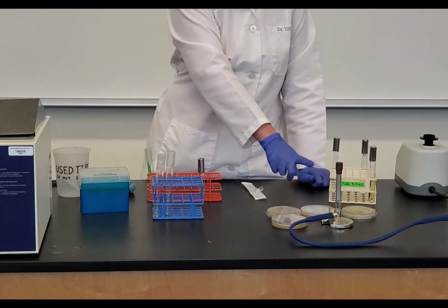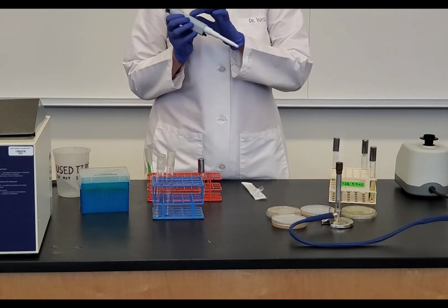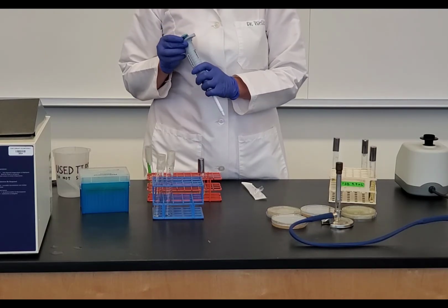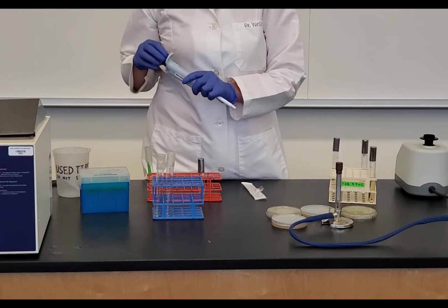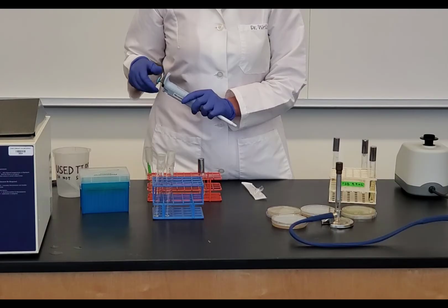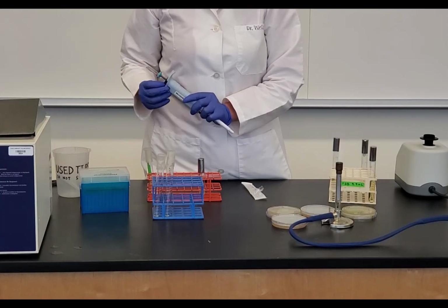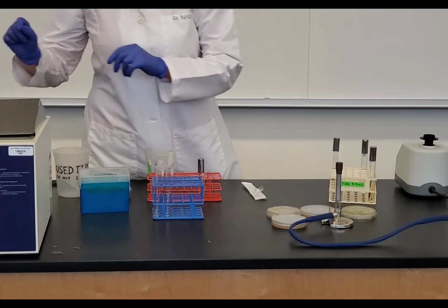So now I've plated my 10 to the negative 5 and my 10 to the negative 7. Now I need to change my pipette to read 1,000 microliters. 1,000 microliters is equal to 1 milliliter. So I'm going to open this, and I'm going to set it to 1,000. And then now I'm going to lock it. Now I'm ready to get another agar deep.